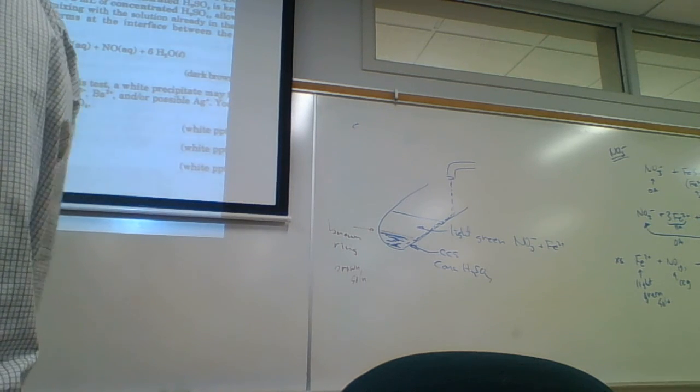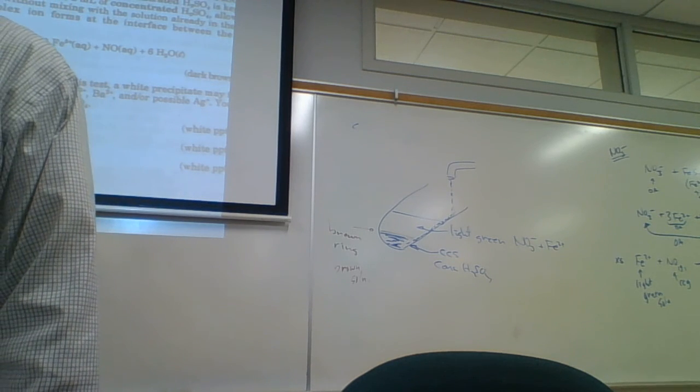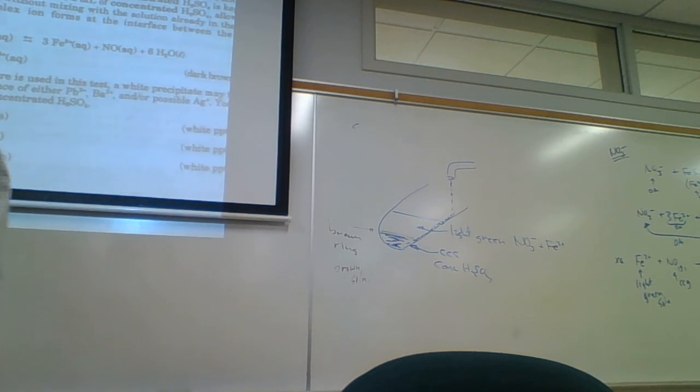If you spill like manganese hydroxide or manganese oxide, that's not that hazardous. So there's sodium bisulfate, no big deal. Sodium bisulfate, not that hazardous. All right, are there any questions?